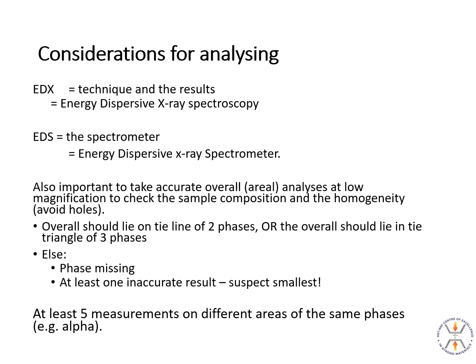And then considerations for analysing. Strictly speaking, and there is a standard on this, EDX is the technique and the results. EDS is the actual spectrometer, so EDX. And then it's also important to take overall analyses at low magnification to check the sample composition and homogeneity. Try and avoid holes.